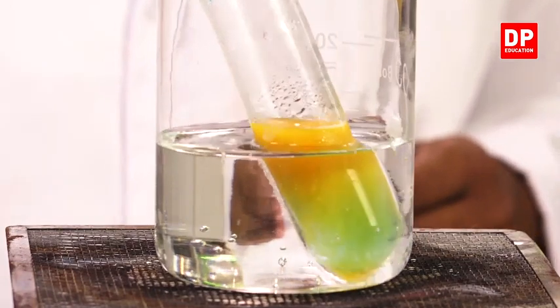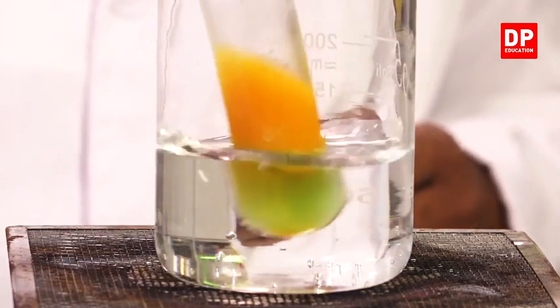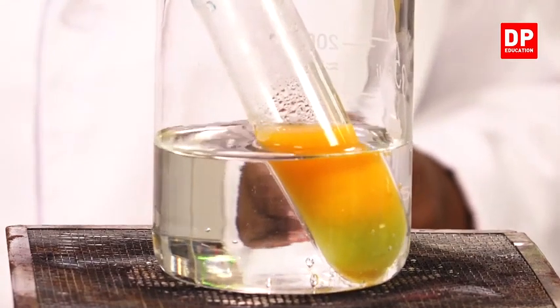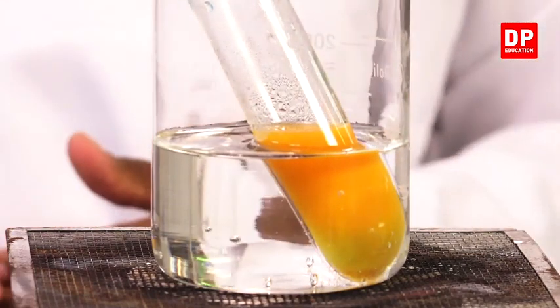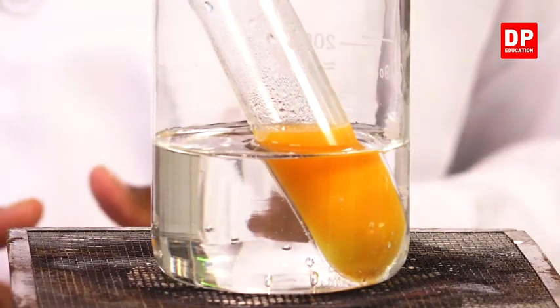I will mix the solution slightly so that the color is uniformly distributed. The yellow will now turn to a brick red color and finally there will be a brick red precipitate appearing.